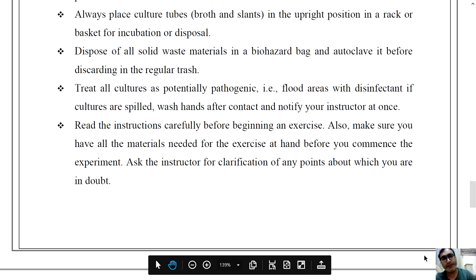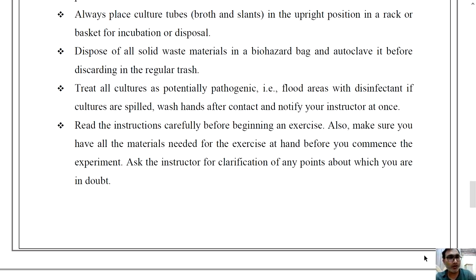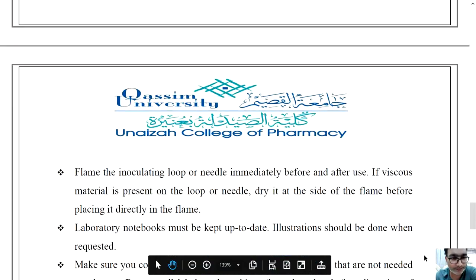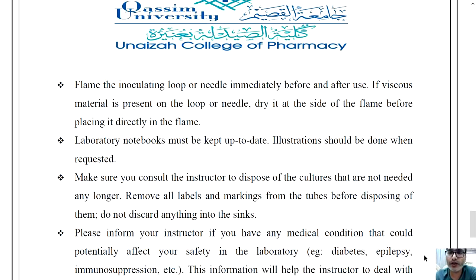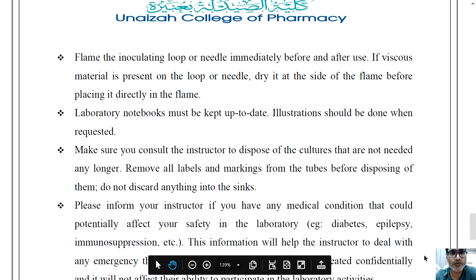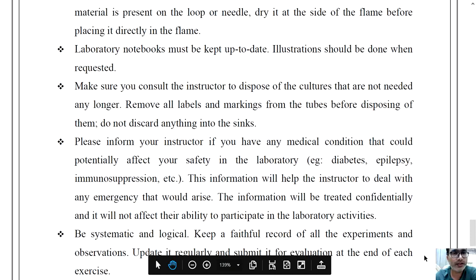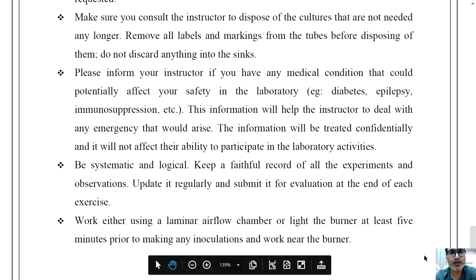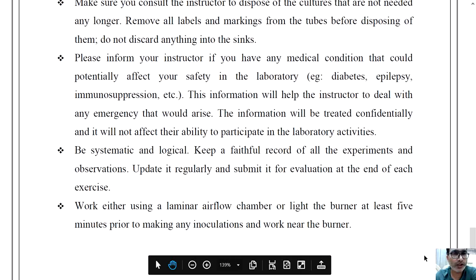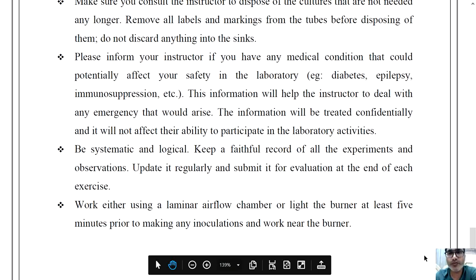Read the instructions carefully before beginning an exercise, and make sure all materials needed are at hand before you commence the experiment. Ask the instructor for clarification of any points you are unsure about. Flame the inoculating loop or needle immediately before and after use. If viscous material is present on the loop or needle, dry it at the side of the flame before placing it directly in the flame. Make sure you consult the instructor to dispose of cultures that are no longer needed. Remove all labels and markings from tubes before disposing of them, and don't discard anything into the sinks.